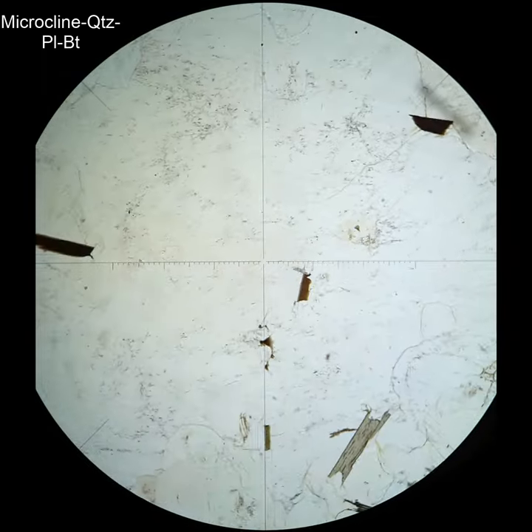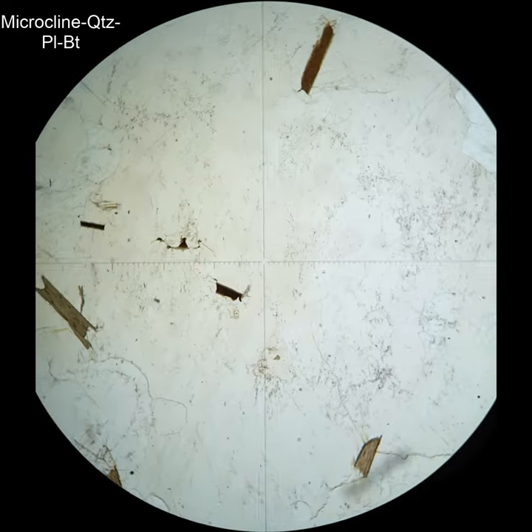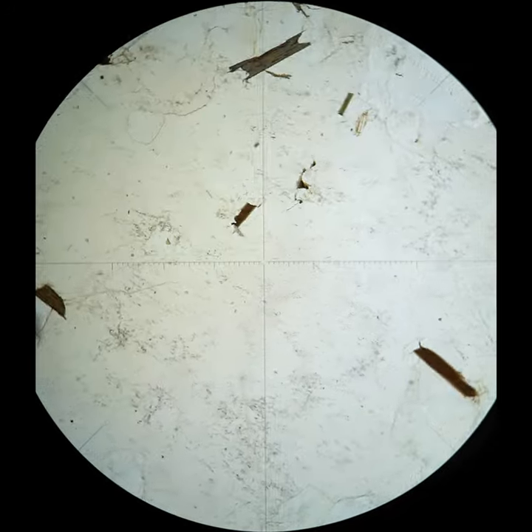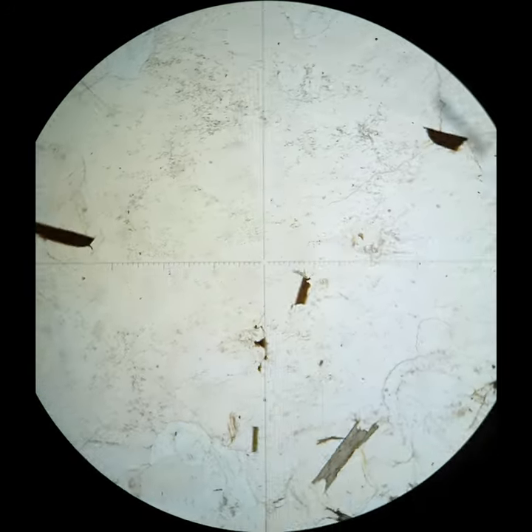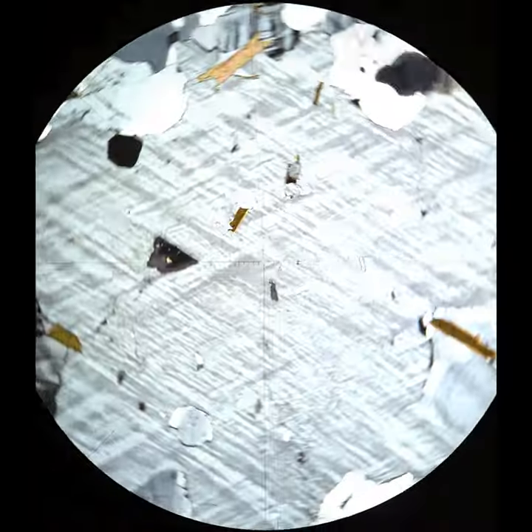This is another microcline crystal you'll see when I cross the polars. K-feldspar has a little bit lower relief than quartz and plagioclase, but that's really hard to see. I'll have to show that to you in a relief video rather than one of these, but here you can see that beautiful crosshatch twinning. It's not at 90 degrees here, it's at some other angle, but that, nonetheless, is distinctive of microcline.